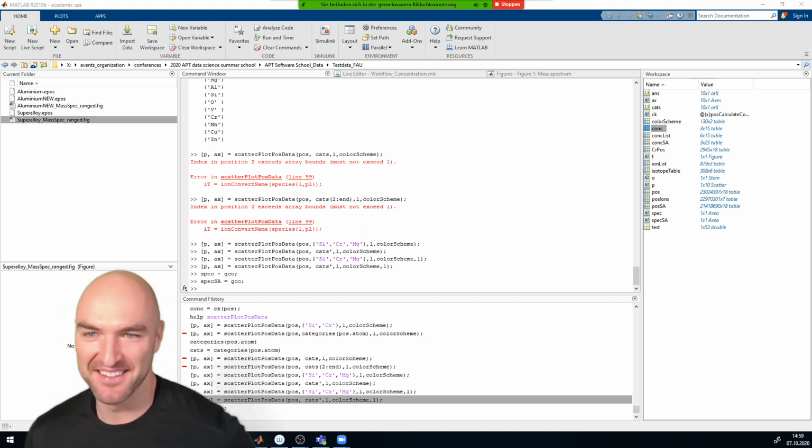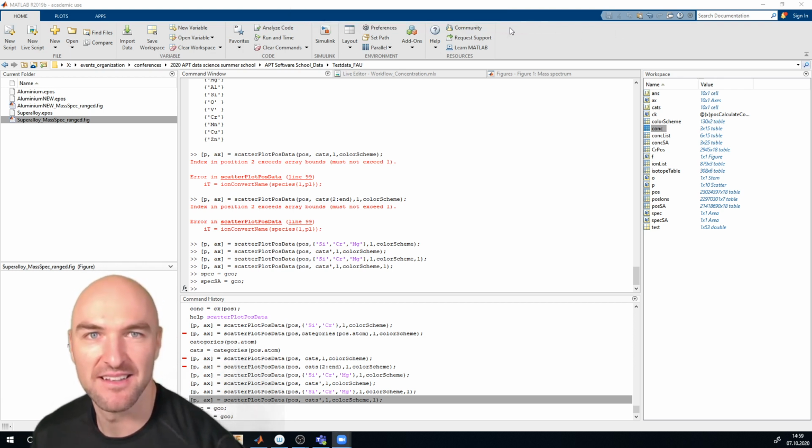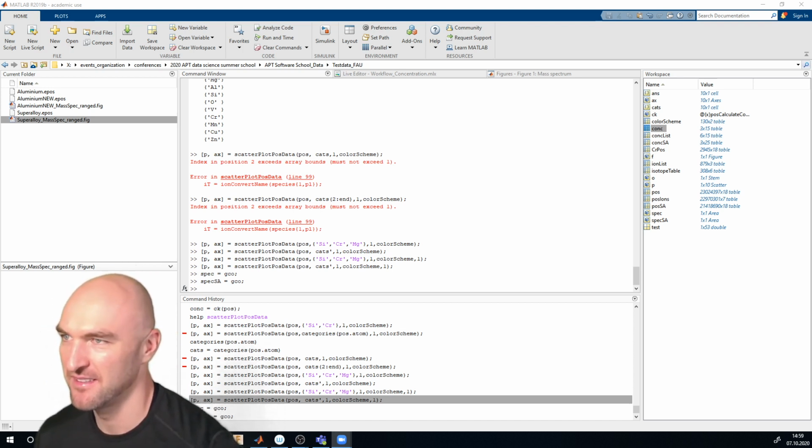For the most part, I'm not using any actual data. It's all simulated data. One of the tools is the mass spectrum simulator, and there's a tiny POS file which we can use that's embedded in Atom Probe Lab.